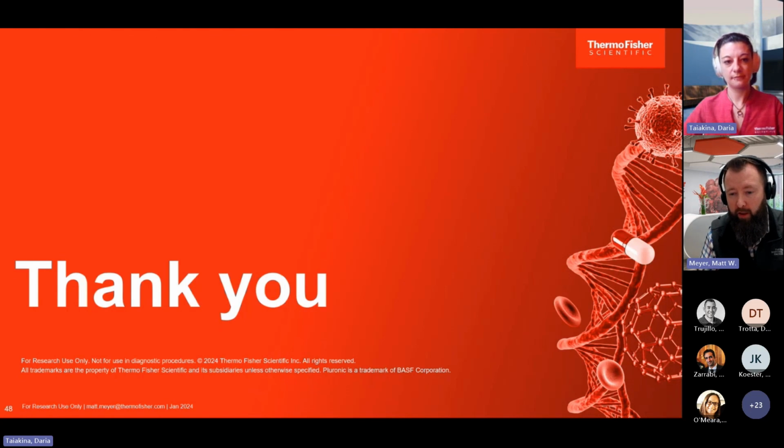There are default settings of 2, 4, and 8. Those will increase as you get further out, where fanning is going to be more prevalent. Those are just default settings, and they can be tweaked in real time while you're sorting, if you notice any side stream fanning. It's very flexible. We just like to note that it can impact efficiency, but the trade-off is better recovery. It's something you can optimize for your individual experiments and fine tune based on the cell that you're sorting. Great, that was a great question.